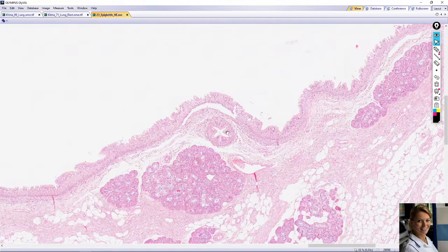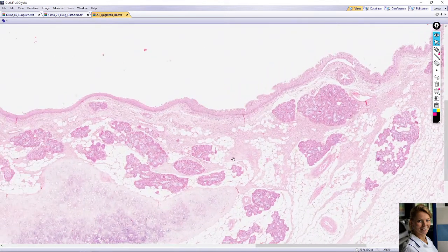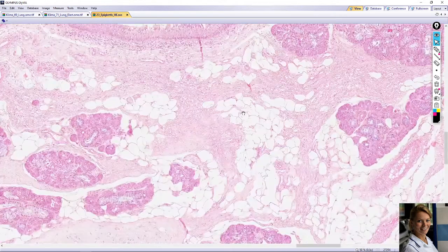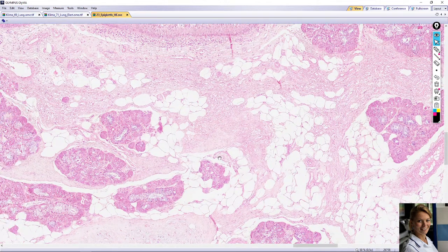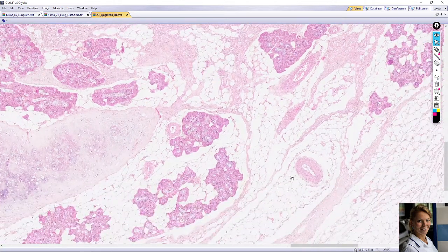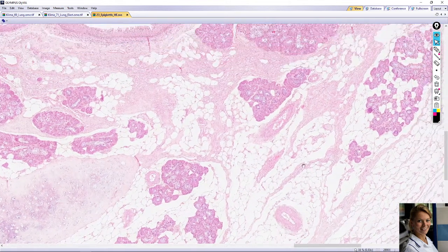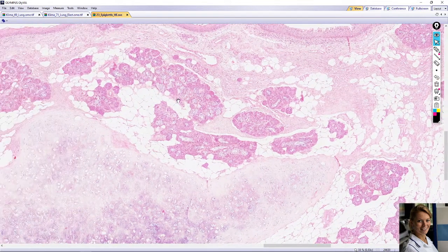Beneath the epithelium we can find the lamina propria, which is loose connective tissue with fat cells, adipose cells, and nerve fibers. There are also small and larger blood vessels — this is an artery here, and also here is a smaller branch.